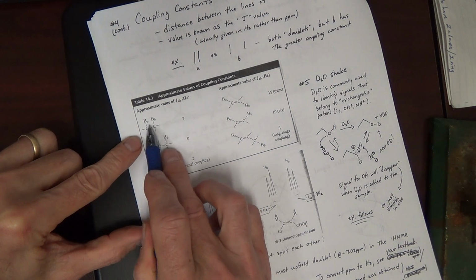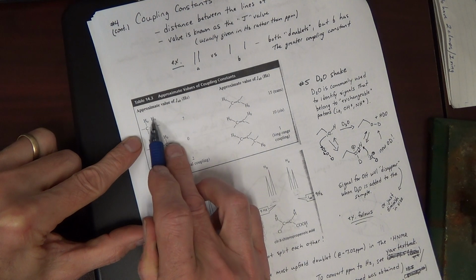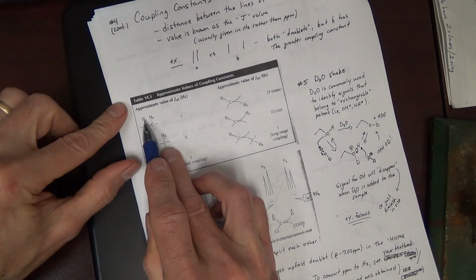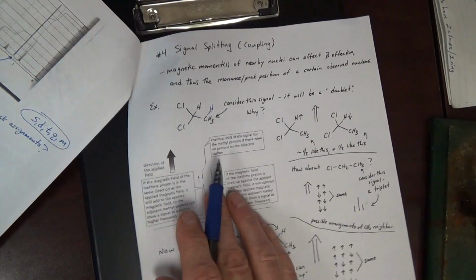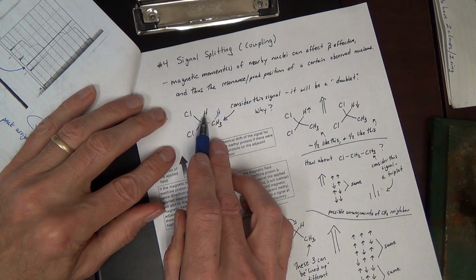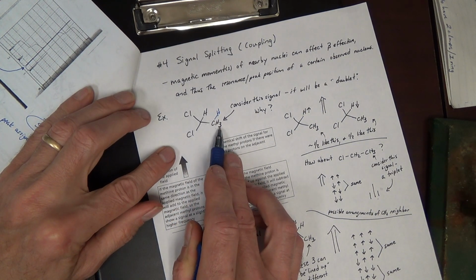With alkanes, okay, if two different H's are splitting each other, by the way, the terminology is splitting each other because if B is splitting A, then A has to split B. Just back over here. If this signal is split by the H, then the H signal must also be split by the methyl.